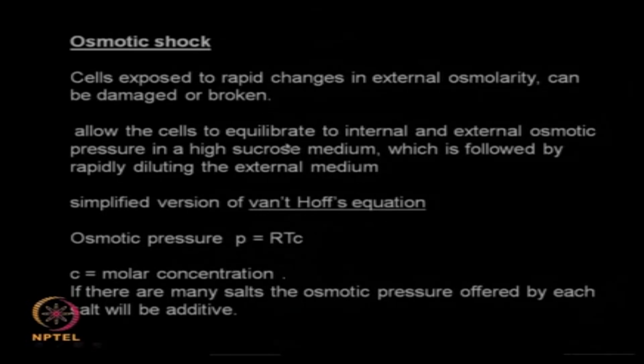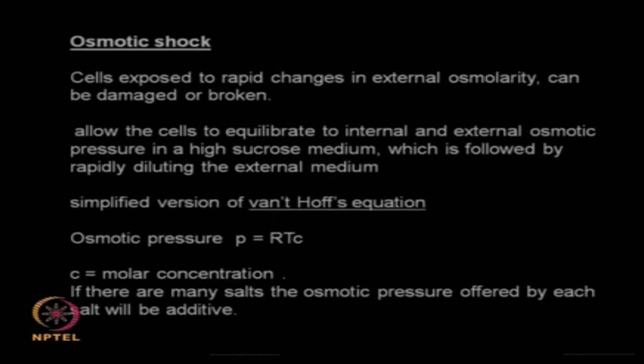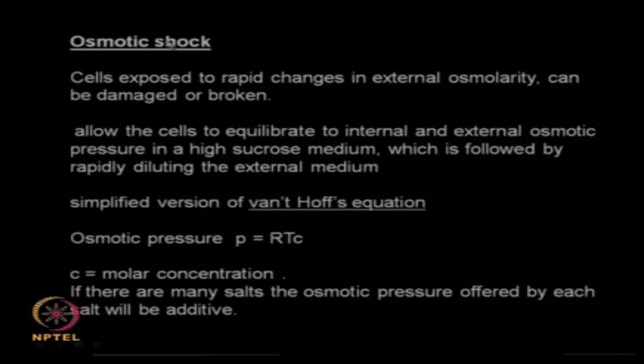So how do you create this high osmotic driving force? I can have a very concentrated salt solution either inside the cell or outside the cell, and just water on the other side. So there is a very large osmotic pressure created, correct? Okay, so how do you do this osmotic shock?